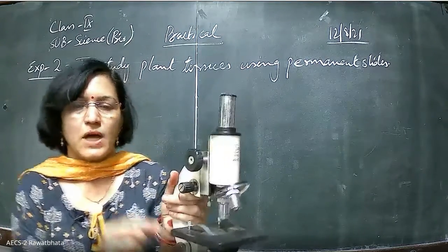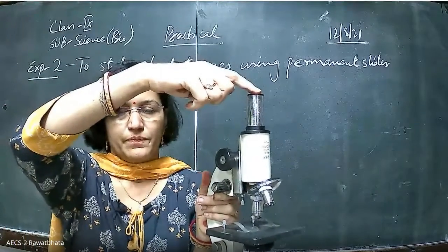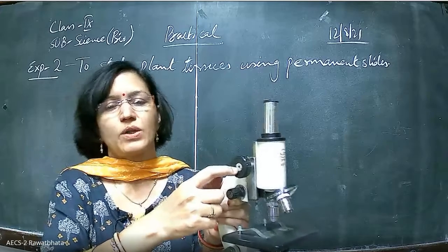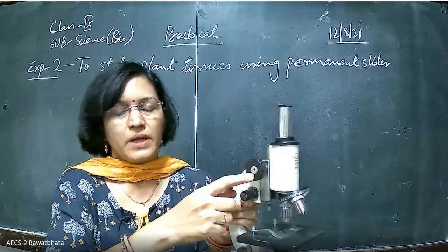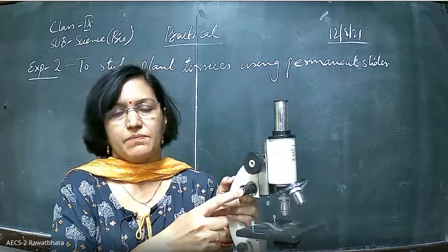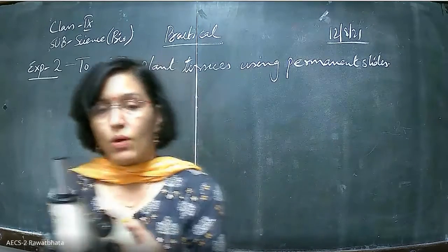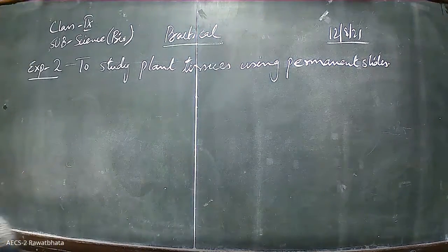And we'll start observing from the top and adjust it with the coarse adjustment, the rough or the major adjustment. And then after that, we'll go for the fine adjustment. And with the help of this, we are going to study all the slides one by one.